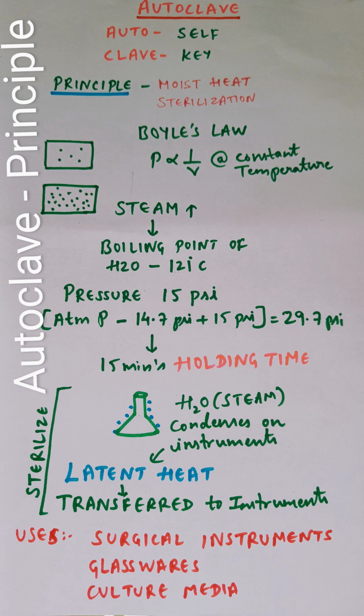Autoclave. It's a Greek word. Auto meaning self, clave meaning key, meaning it has a self-closing mechanism, meaning once the pressure starts building up inside the chamber, it is difficult to open this machine. So this is called autoclave.